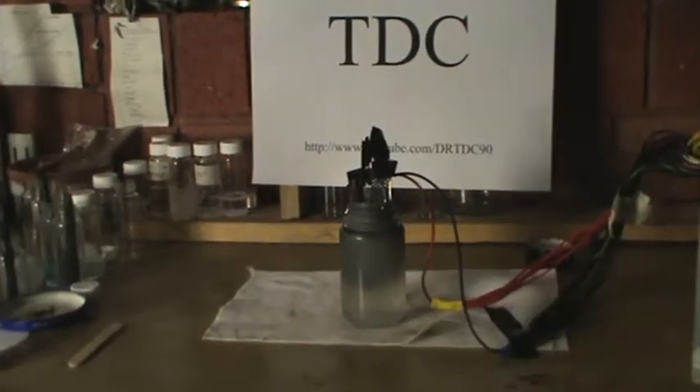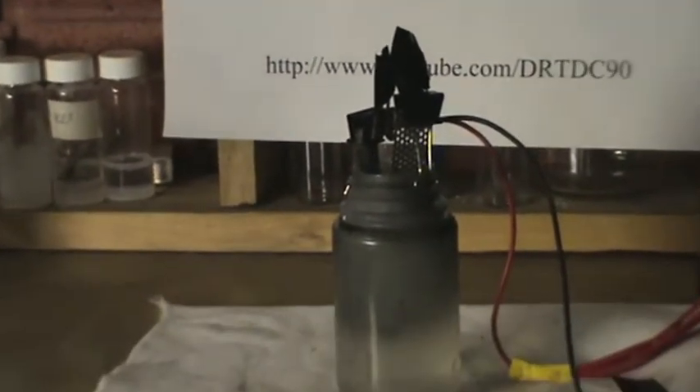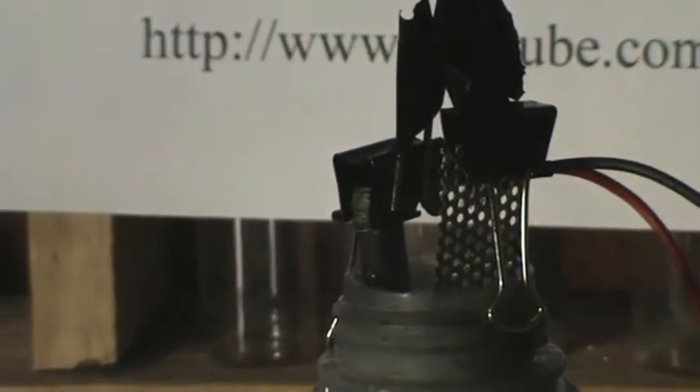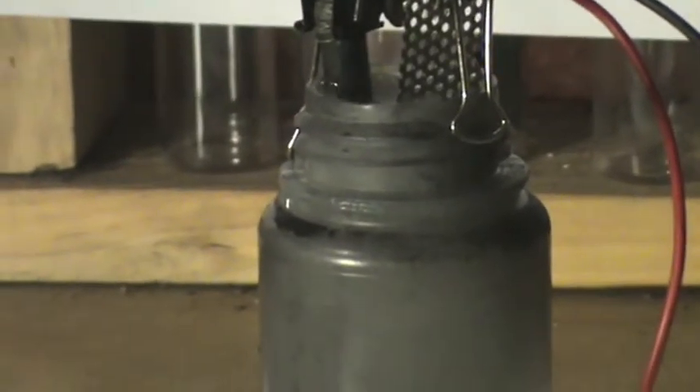The treatment process takes 30 minutes to complete. As the experiment runs, the solution fills up with black particles of carbon. This is normal as the surface of the graphite is being thoroughly cleaned and etched.